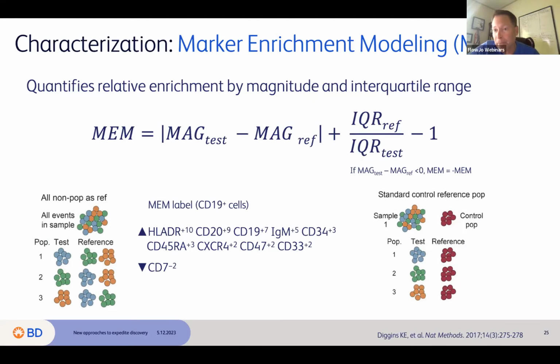I love this idea. The idea is that when we finish clustering, we're frequently handed cluster 1, cluster 2, cluster 3, a bunch of relatively meaningless names for clusters, and you could spend an awful lot of time trying to figure out what are these. And perhaps even more importantly, you might spend that time trying to figure out what they are, to give it a text-based biological name. You might want to call it naive T cells, something like that, naive CD8 T cells.